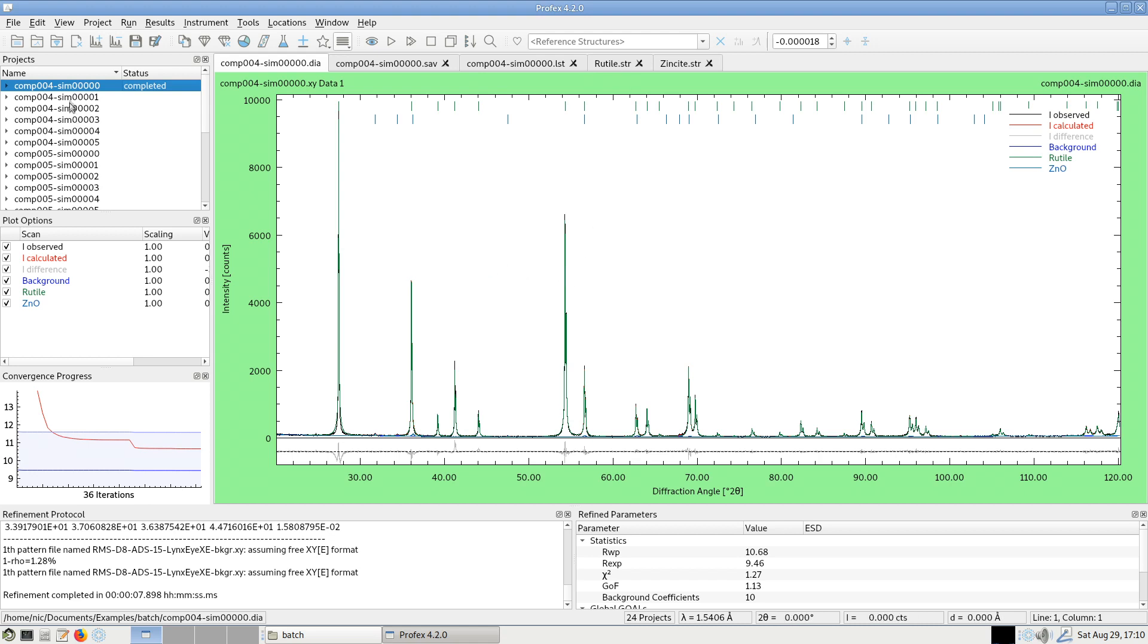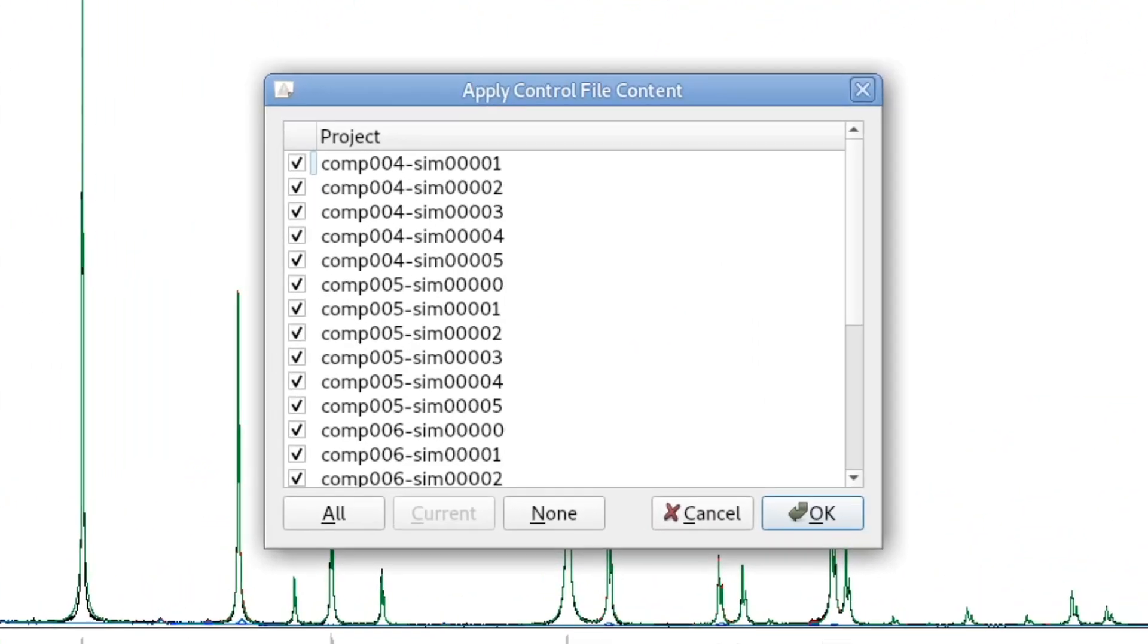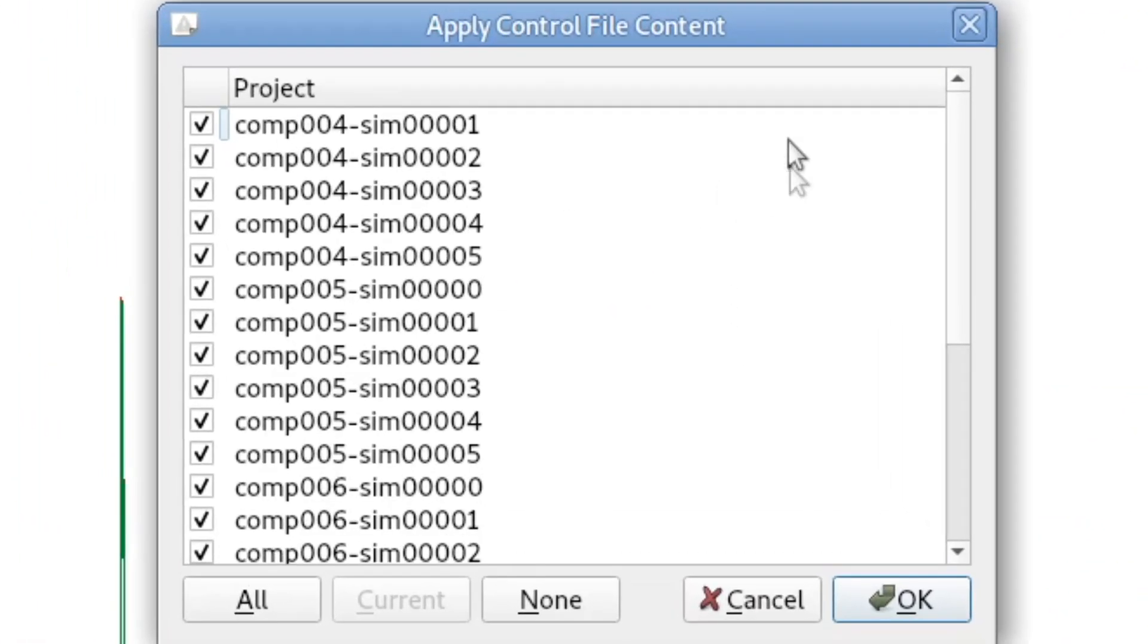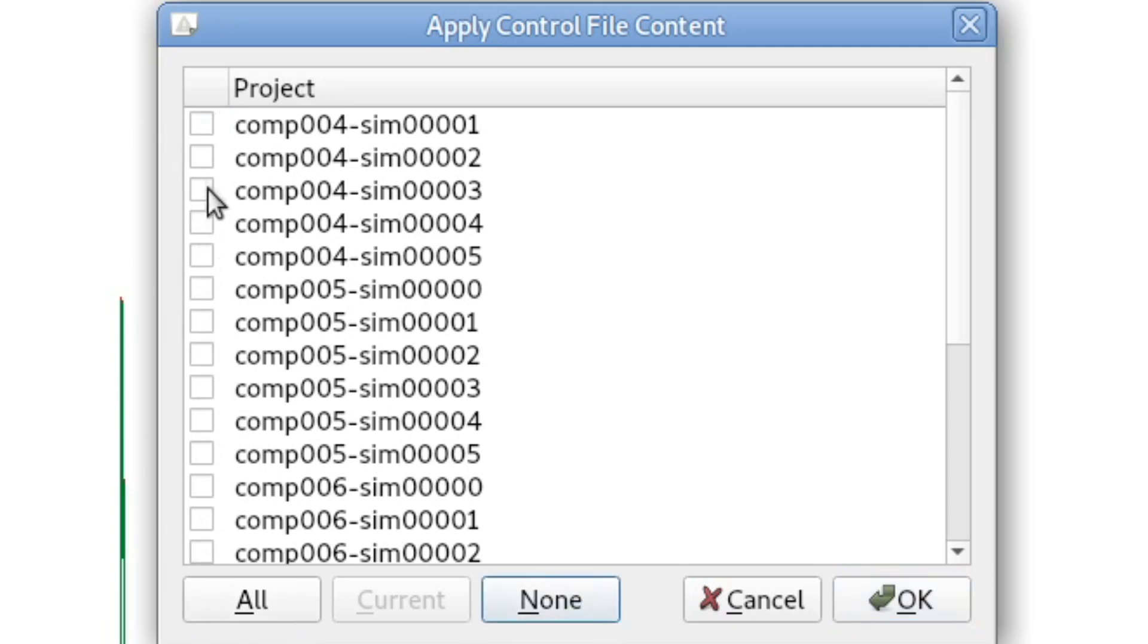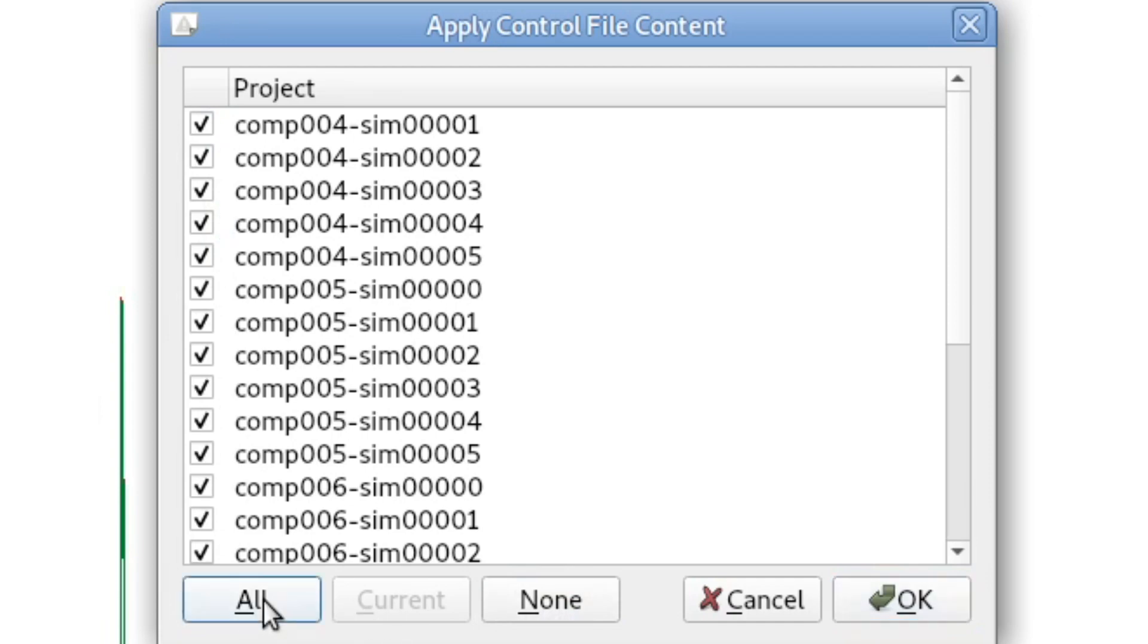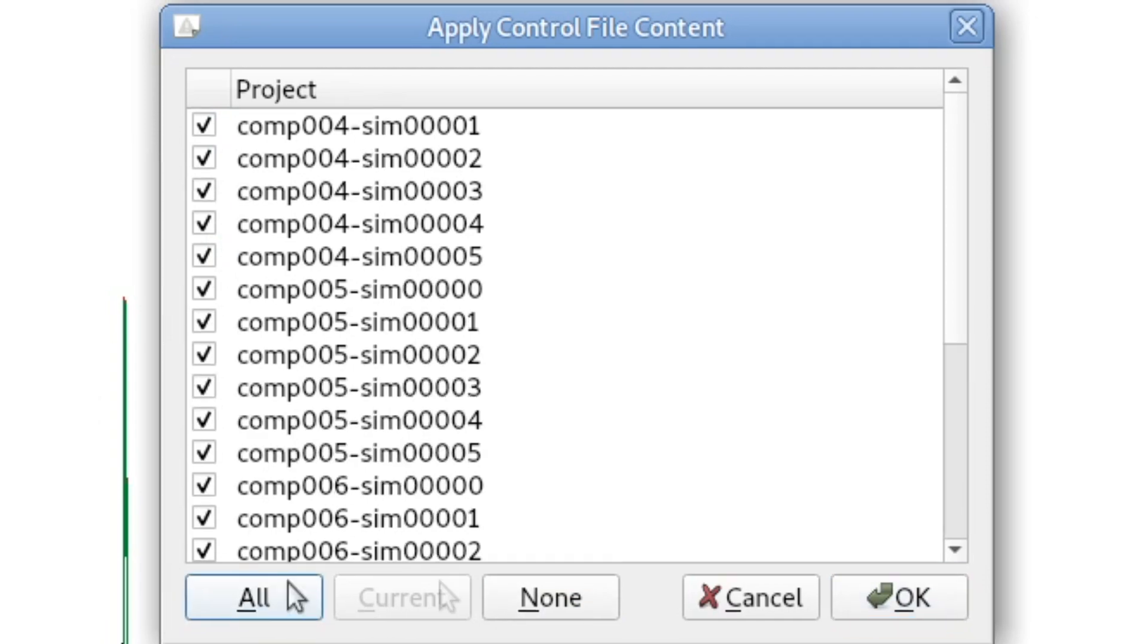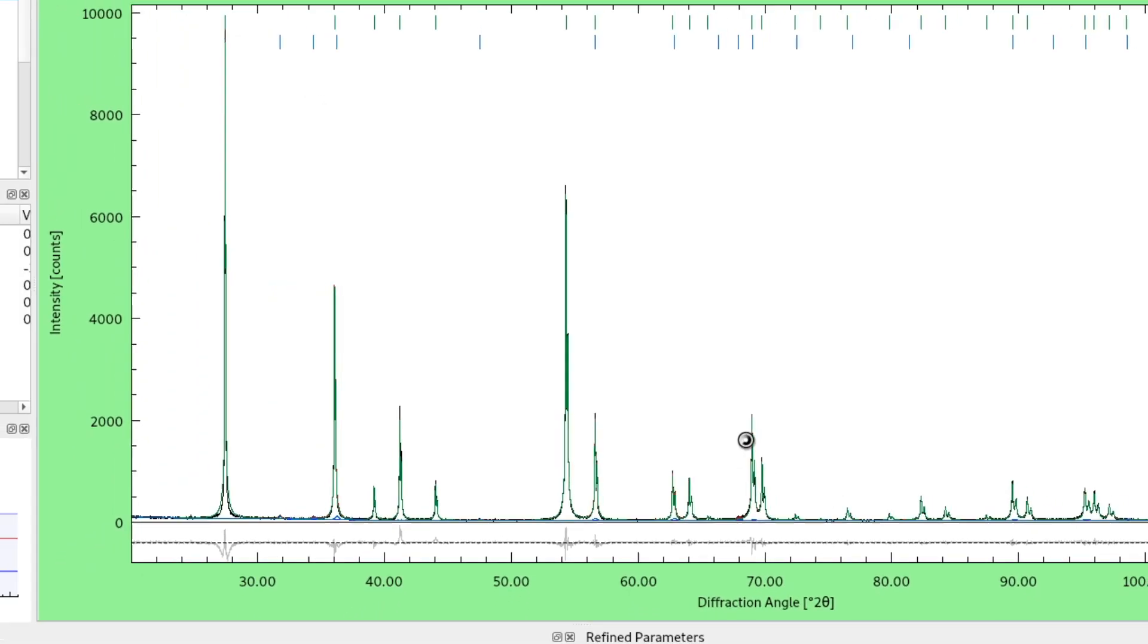And I simply have to click this button: Copy the current control file to all open projects. And I will see a project selection dialog. I can select to which of the open projects I would like to apply it. There are some quick selection buttons. For example, I can click none and just select a few of them. Or in this case, I want to select all of them. Click OK.